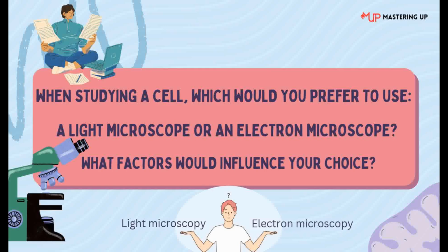When studying a cell, which would you prefer to use? A light microscope or an electron microscope? What factors would influence your choice? By the end of this video, you will get to know when to use light microscopy technique and when to use electron microscopy technique while studying a cell.